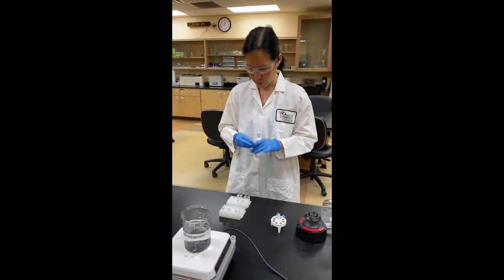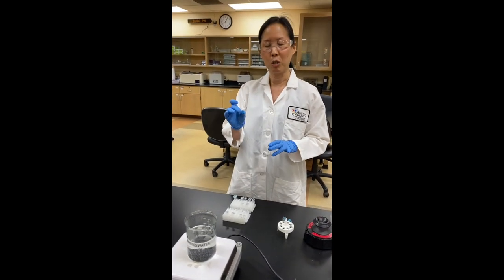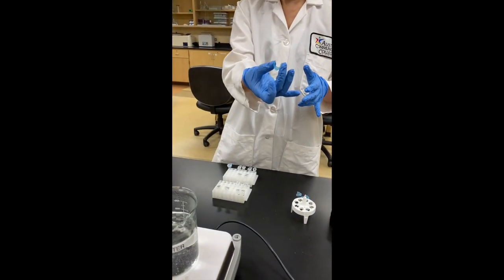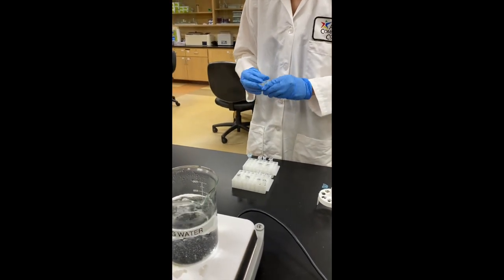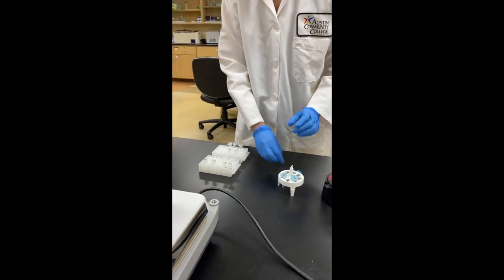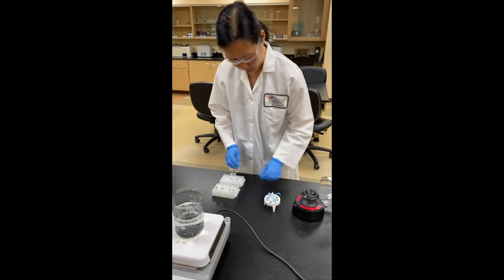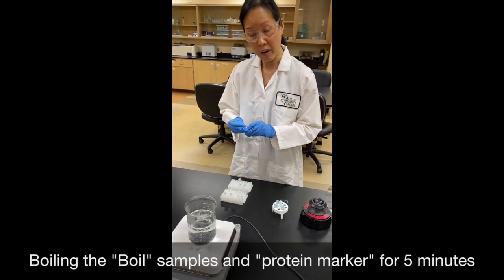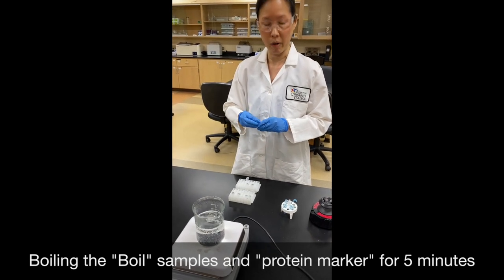You should have a total of five tubes going into the boiling water bath. To prevent them from exploding while boiling, apply reusable cap locks to the tubes and place them in a floatie to keep them from submerging. Put the floatie in the boiling water bath for a total of five minutes. Once the five minutes are up, take them out and set them aside to cool to roughly room temperature.